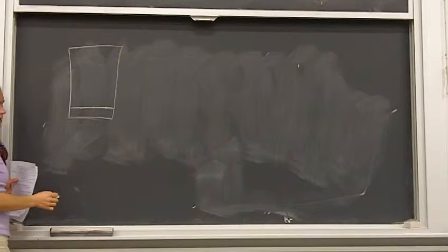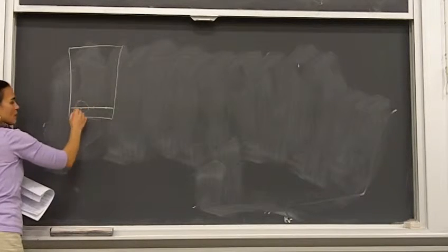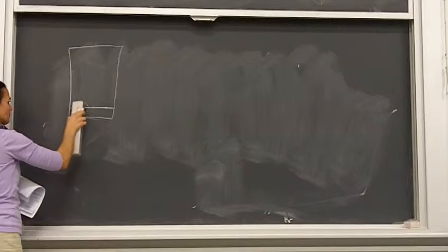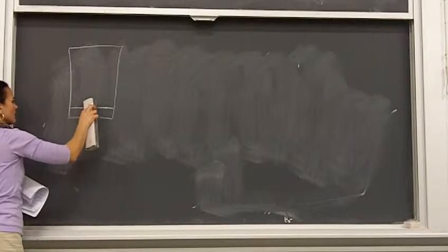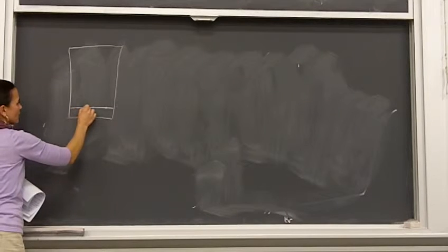So when you go to spot your TLC plates, you're spotting right on that line. The capillaries, we also have to teach you how to make those, because you want them really, really thin so that these spots aren't really, really big. We want little spots, not big spots, okay?